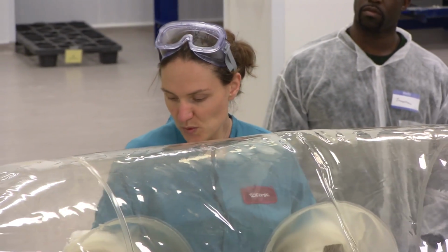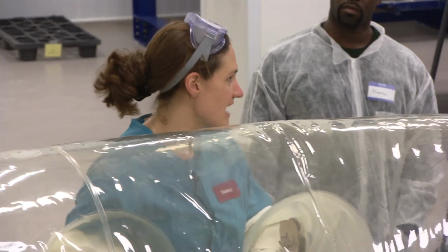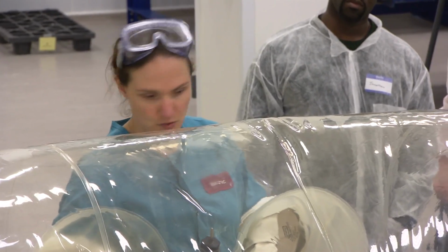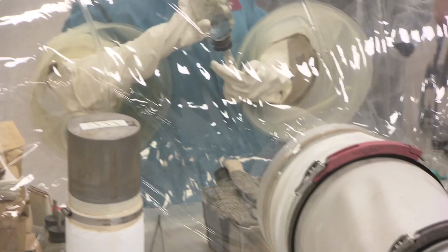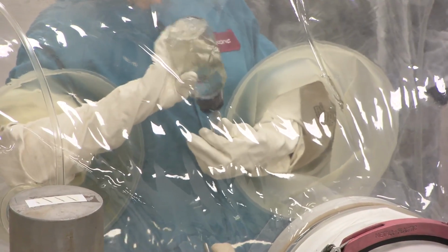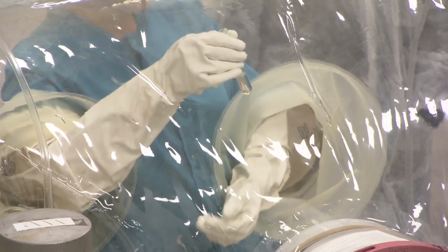Now, we will put water from the bottles that have been on the cages with the animals for a minimum of a day. So we'll just go through however many cages we have, and we'll just put in a few drops from each of the bottles, and normally we'll end up filling the culture tube up to there.